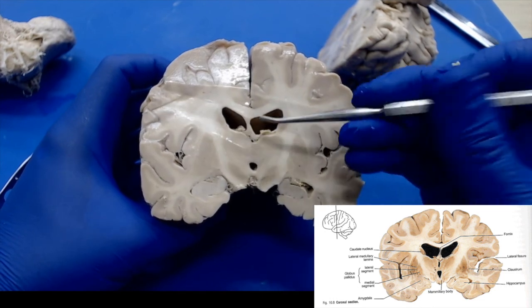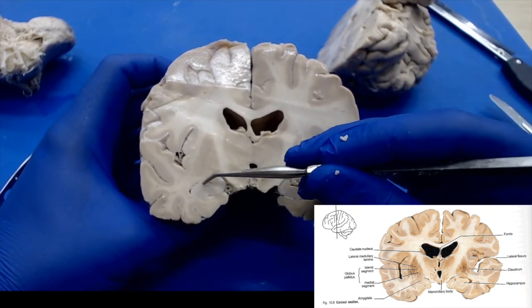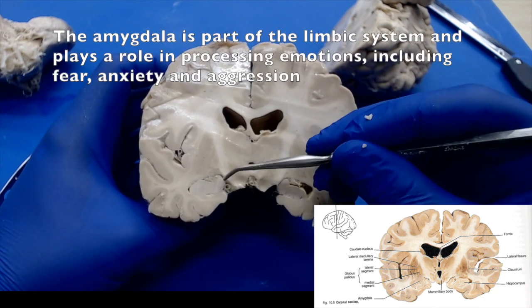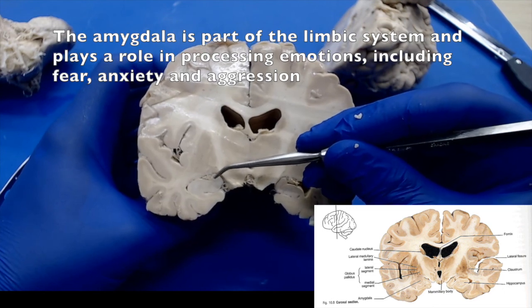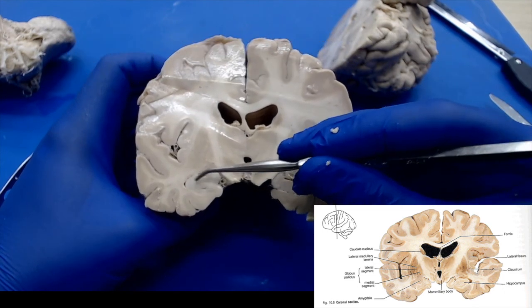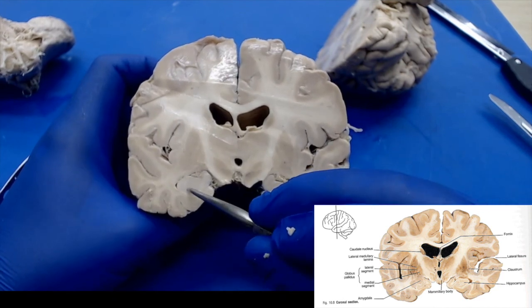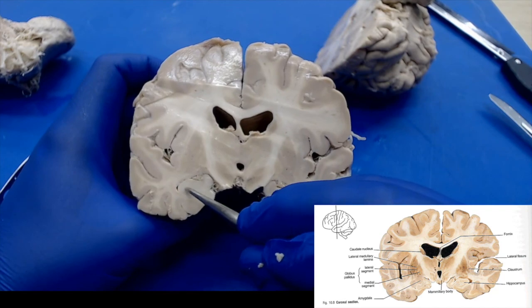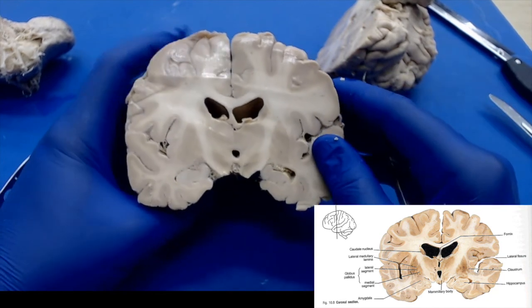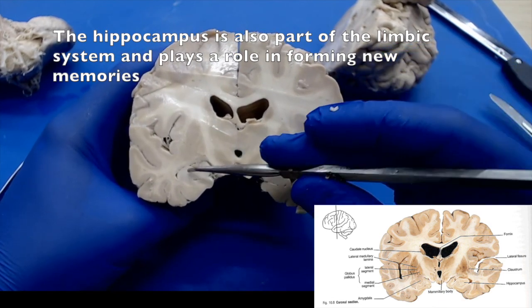Additionally, we have this little curly Q here. This is going to be our hippocampus, and this region above is going to be the amygdala, which is kind of your reptilian brain. The hippocampus is important, and the way to find that is like a cinnamon roll, or Roseanne likes to call it a little captain's hat. You just kind of look for this little swirly swirl. You want to take a section of that, and that's really important for demonstrating signs of early hypoxia that may not have been noticed clinically.